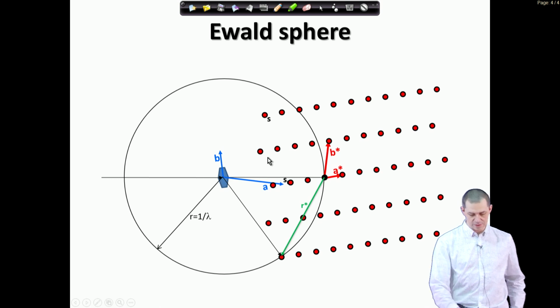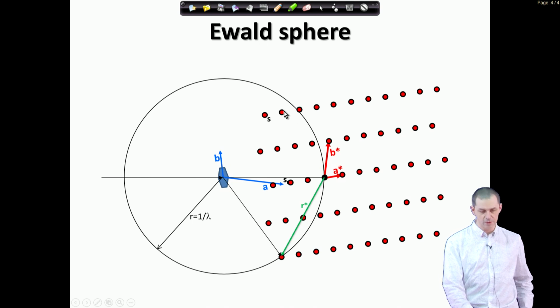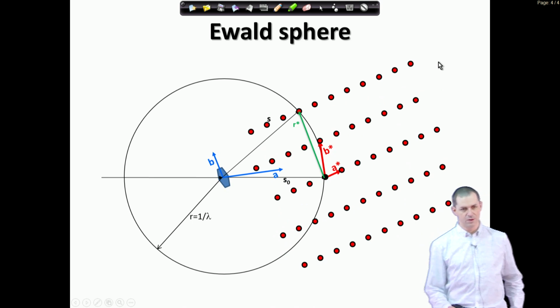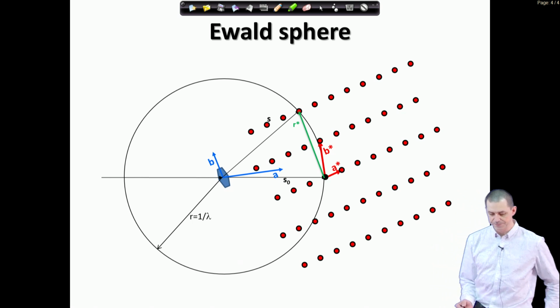The reciprocal lattice rotates in the same way, and then suddenly this reflection is not in diffraction position anymore, but there is another reflection in diffraction position. So we will get a different diffraction pattern. And this is again one more example with continuing rotation counterclockwise.